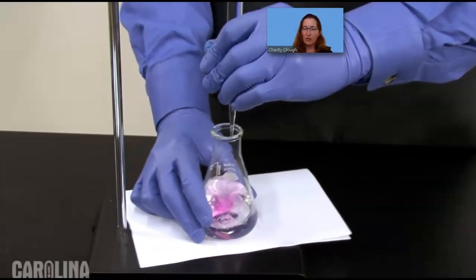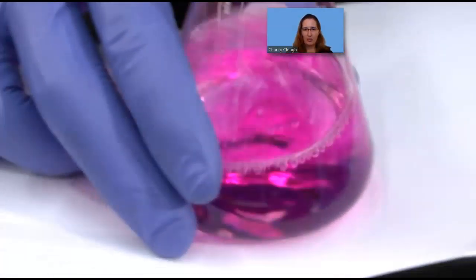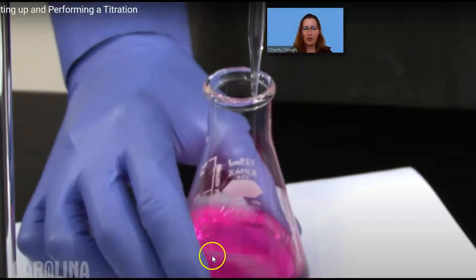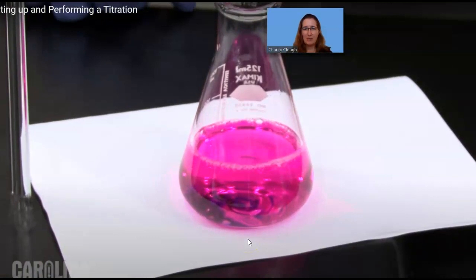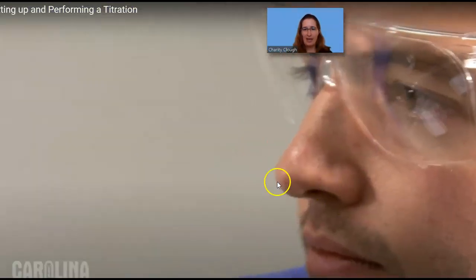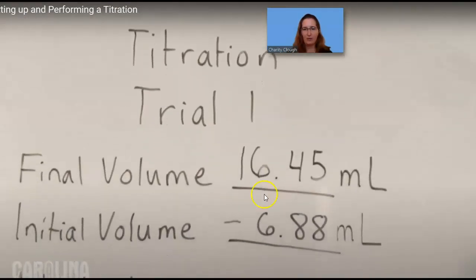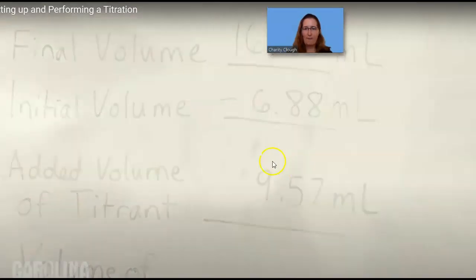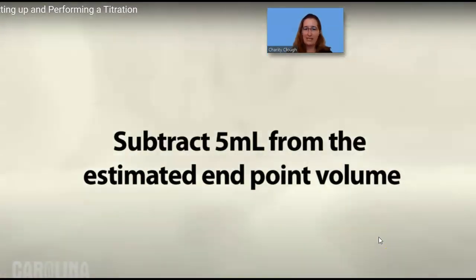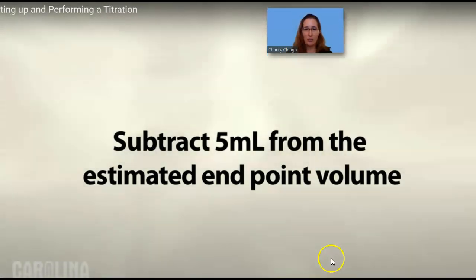The reason he's swirling it is to stir it. If you're doing this in a lab, like with a really precise setup, I would use a stir bar. You can see his is really pink there. That's to do a quick guesstimate. If you did this in a lab and you got it to be that pink, that would actually be a really bad thing if that were going to be your final trial. So that's their initial one. They knew about how much volume of base it took to get their final solution, so they're going to go back and do that again a little slower.